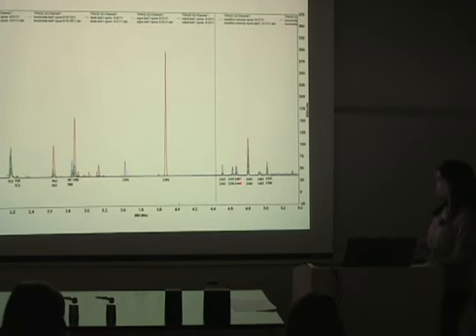And then the same is true. This is the chromatogram for the leaf of all the cultivars analyzed using the spinning method of extraction. And we can see how the patterns repeat even more, and how this shows even more similarities between the cultivars.